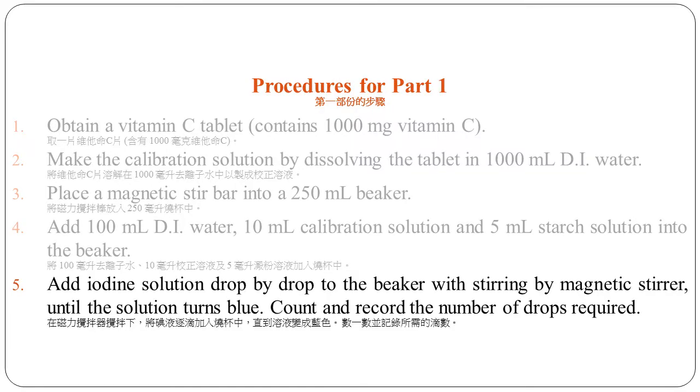And then add iodine solution drop by drop to the beaker with stirring by the magnetic stirrer until the solution turns blue. Count and record the number of drops required. Let's see a video.